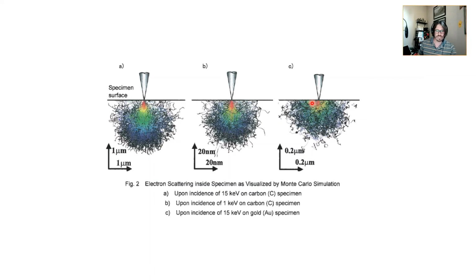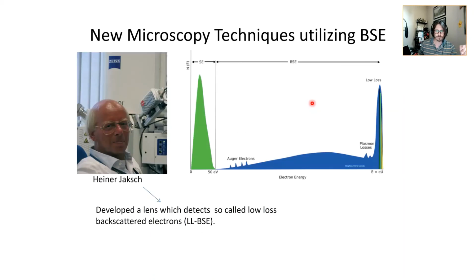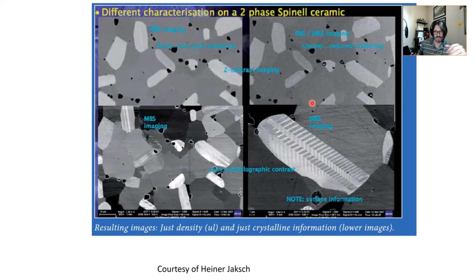The maximum accelerating voltage on the 3500 is 30 kilovolts. And so people always want to amp it up. Two things: you'll kill your filament a lot quicker. Also, you might not be getting the spatial resolution you need, depending on what you're looking at. So back to this, I kind of took that little segue.